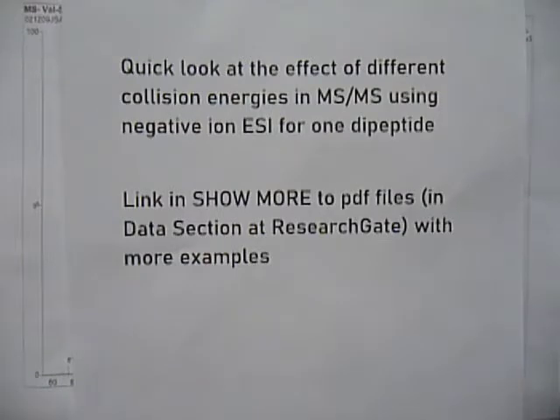This is a video in which we're going to do a quick look at the effect of different collision energies in tandem mass spec using negative ion electrospray, and for one example of a dipeptide, Val-Serine.